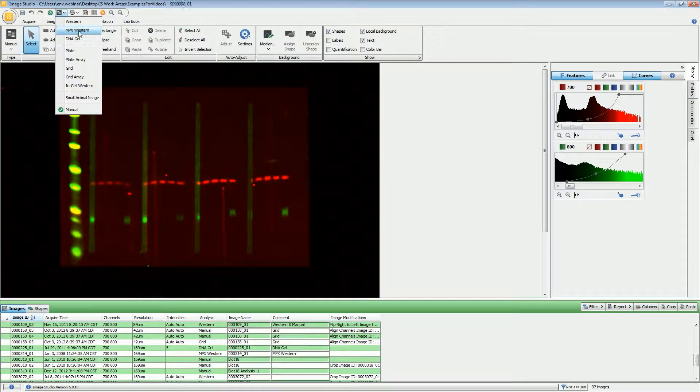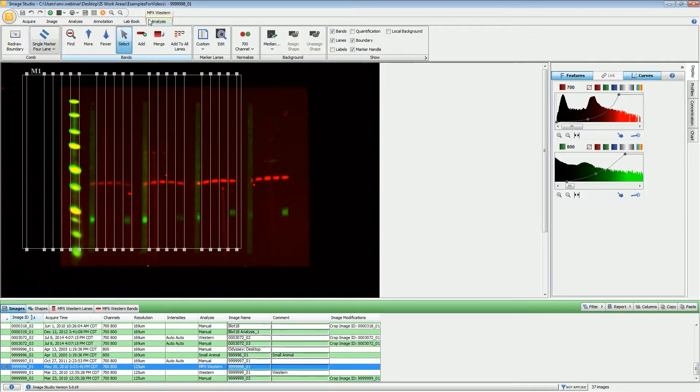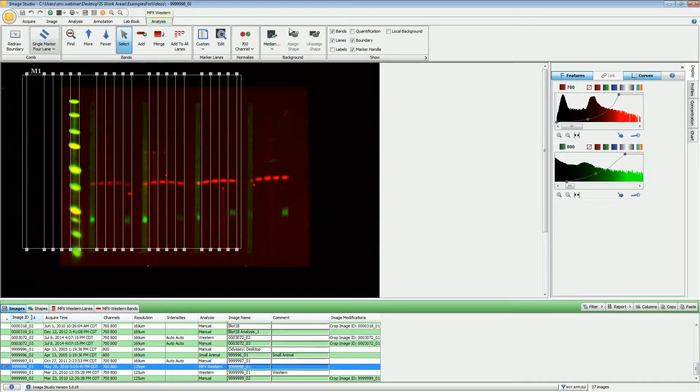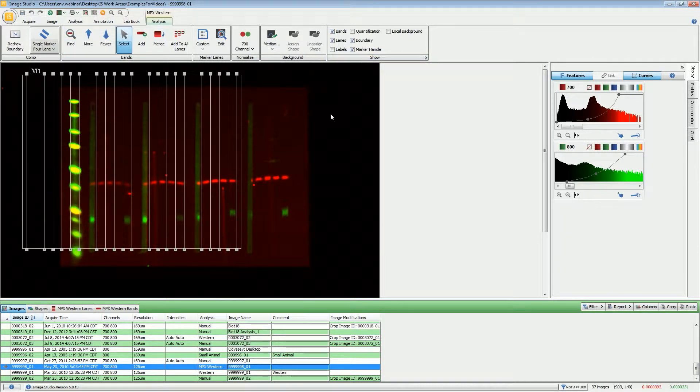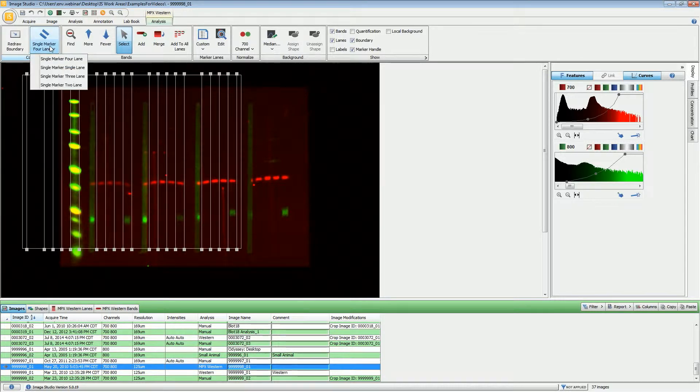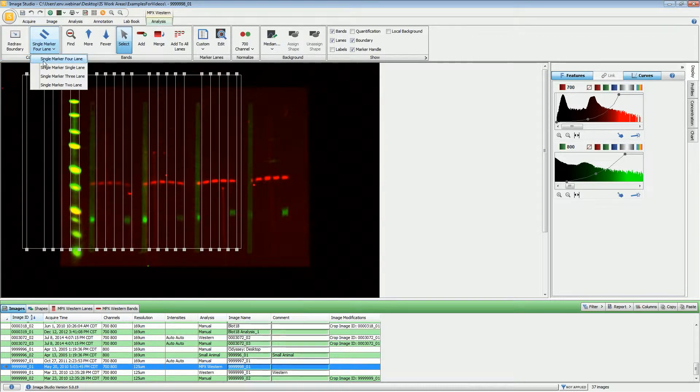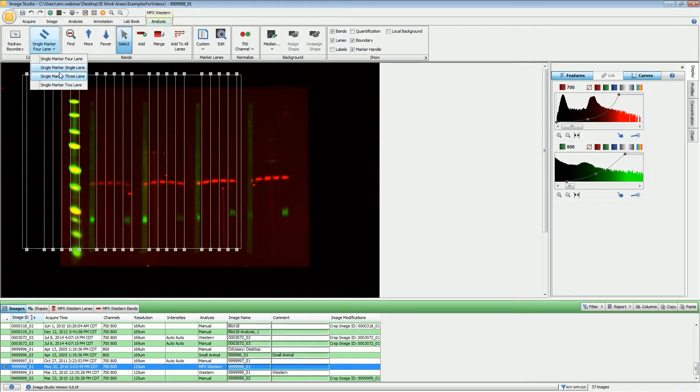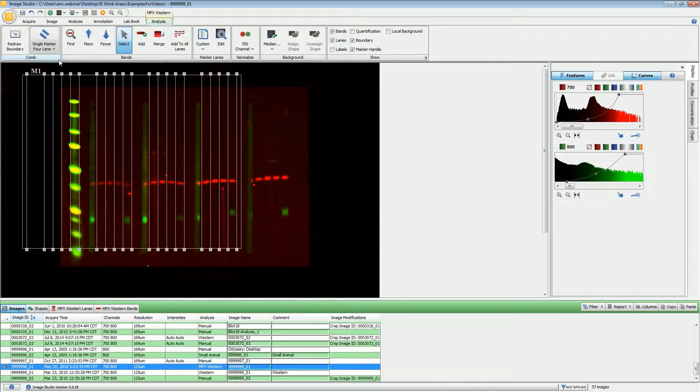You'll notice that there will be a new ribbon that appears with all the options for the MPX Western analysis. Chances are you will need to redraw the boundary for this and also choose the marker type or the lane types that you have. For this particular image, we have a single marker lane with four sample lanes. That's what I'm going to choose.